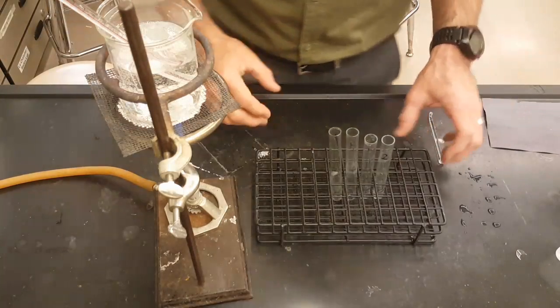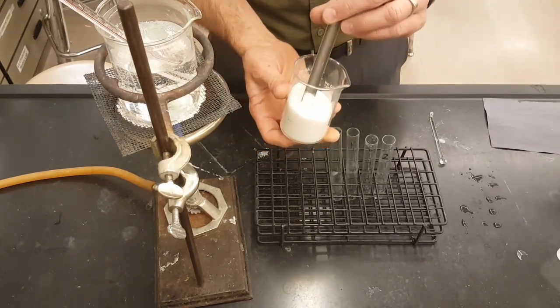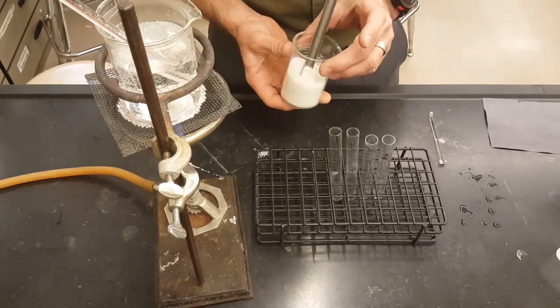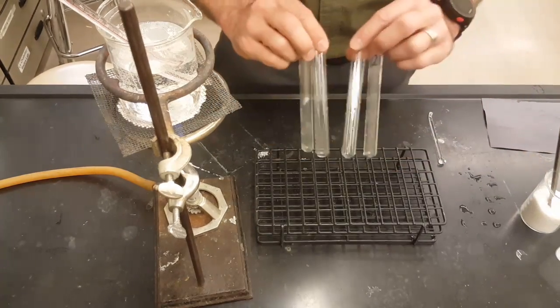Hey, good morning. I'm going to give you a quick and simple demonstration for how to take potassium nitrate and make a solubility curve. To do it, we need multiple data points. And so we have 4 different test tubes.